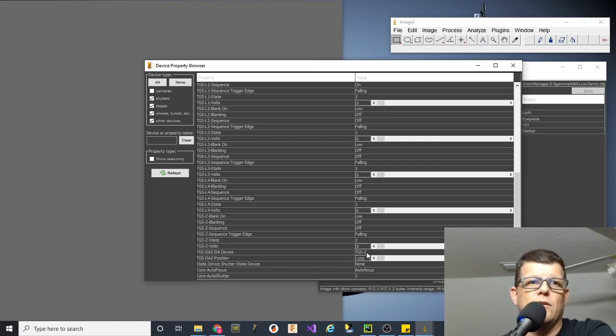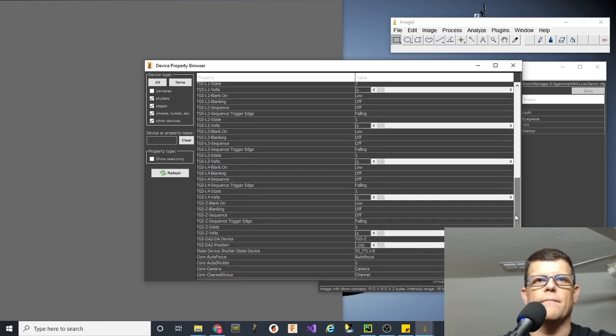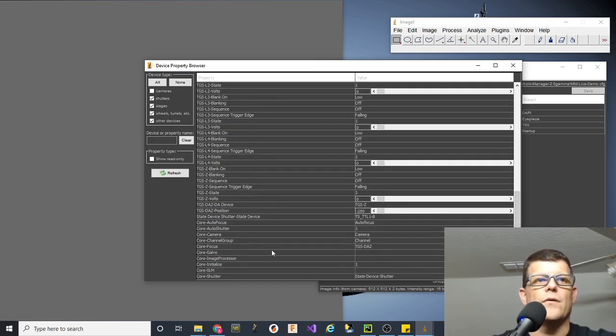The next thing I want to do is set the core shutter state device to Triggerscope TTL 1 through 8. What this does is if Triggerscope 1 through 8 is anything other than 0 and you quote-unquote close the shutter, then it'll drive it to 0. And if it's 0 and you open the shutter, it should drive to that value. So this allows us to treat the TTL output pins as a state control for the shutter. With that done, I will double check my core focus is defaulted to DAZ.